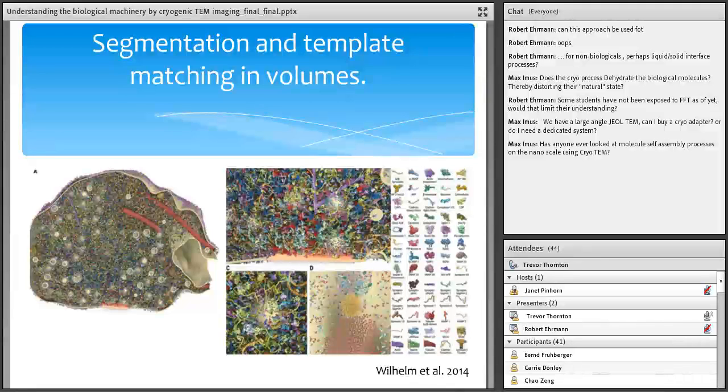I worked with a guy named Chaim Baum at the University of Pennsylvania who had a very cool liquid cell, and other people are using graphenes to trap water between two layers and then imaging the dynamics of the chemistry in between those two layers.